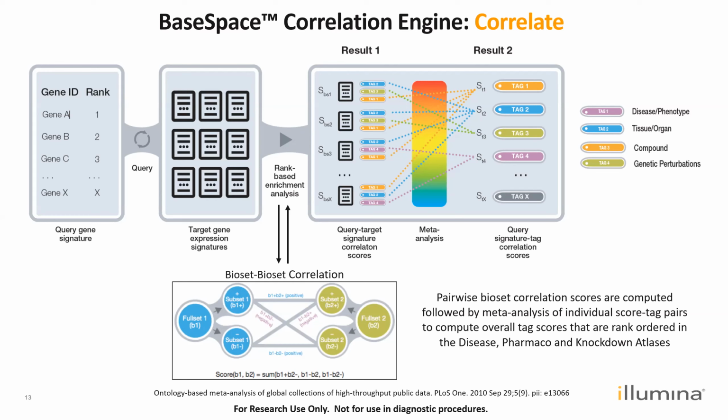Enrichment p-values are then determined in all directional combinations, which results in an overlap p-value for the comparison. This is automatically done between the queried bioset and the 140,000 other biosets in the system. From that, the lowest overlap p-value drives the best comparison to the top, with all rank ordered results below that one. It's not unusual to see thousands of ranked studies.